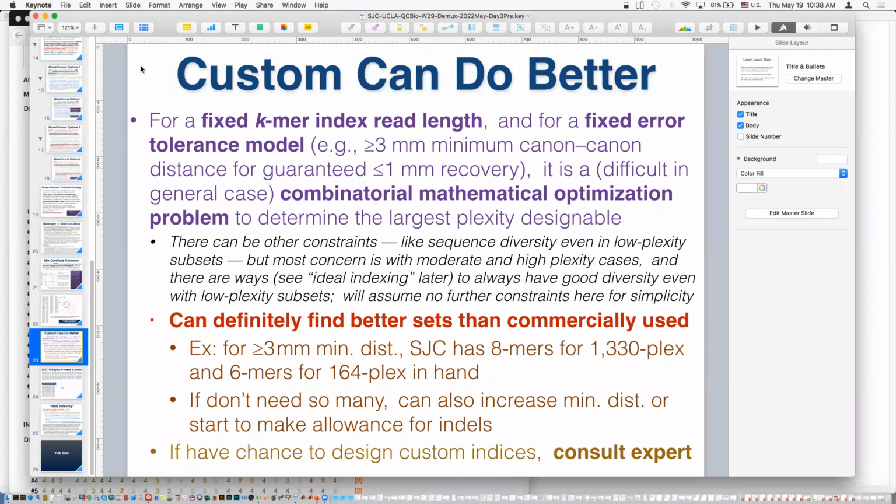The binary, maybe, or whatever, instead of mega, but basically it's a million. And so if you want to have a 2 million plex, you can't do it. This is not enough distinct frequency. I probably should have used a shorter length. If your tags are two letters, then there are only 16 of them. There's no way you could have 20.